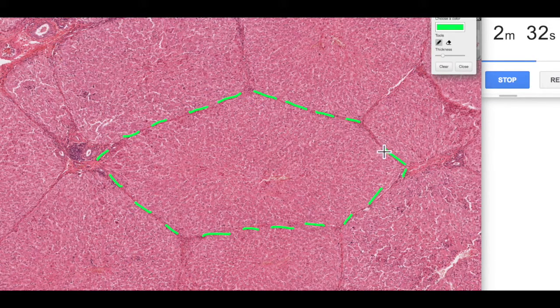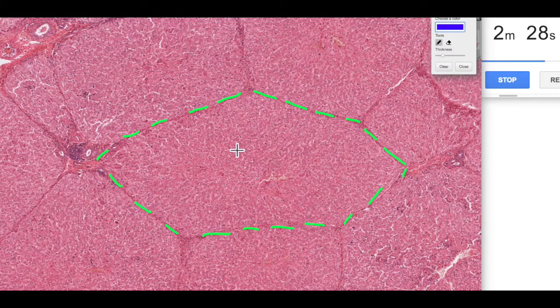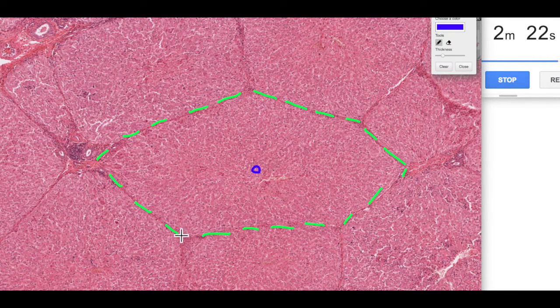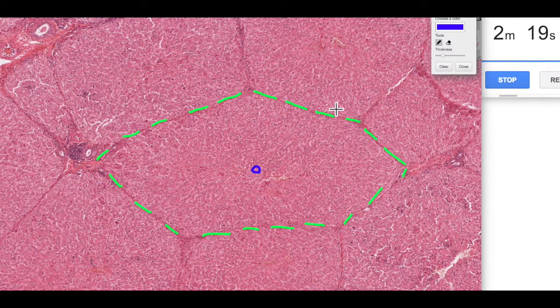We've got our central vein in the middle, and the idea is that we've got these six points which are our portal regions or our portal triads.